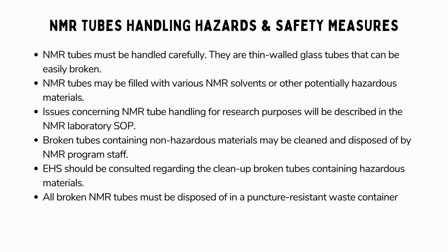If a tube breaks and contains non-hazardous materials, the NMR program staff is responsible for its cleanup and disposal. For broken tubes with hazardous contents, consult the Environmental Health and Safety (EHS) department for proper cleanup guidance. Dispose of all broken NMR tubes in a designated puncture-resistant waste container to ensure safety.